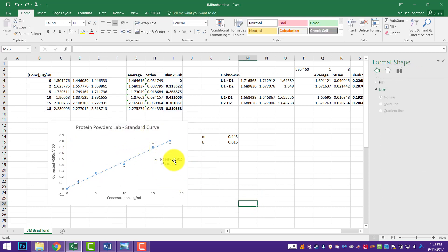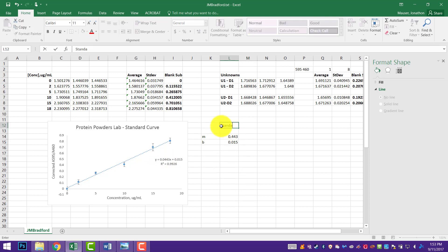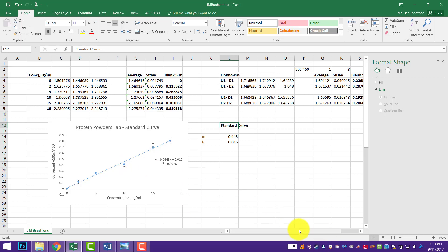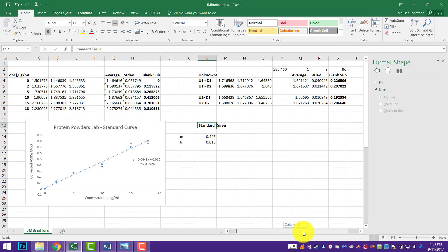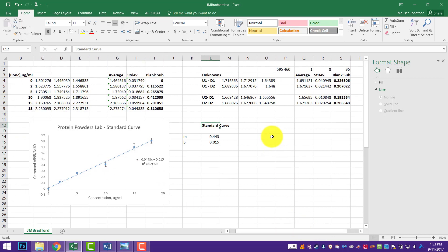Here is our finished standard curve for our Bradford assay. Again, we want that R squared value to be around 0.9 or greater — if it's less, you should go back and redo it. So we now have a standard curve and an equation for our line, and now we're going to use that data to come up with our unknowns.